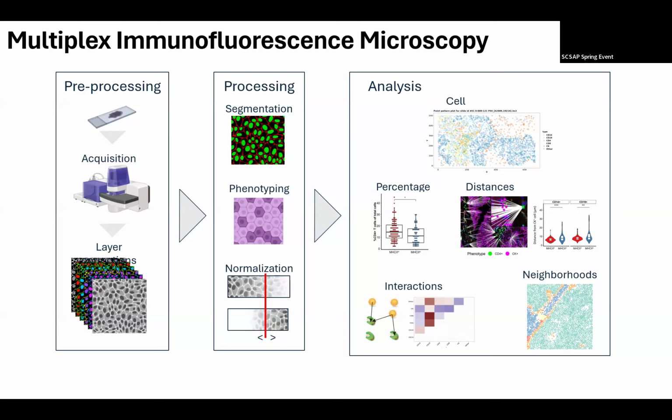As I mentioned, multiplex proteomics, spatial proteomics, has been a recent endeavor over, I want to say, the last 12-18 months. That includes multiple things in terms of pre-processing and all the way up to analysis, and the different flavors of analysis. Some are first order exploratory analysis, which might be just looking at prevalence of cell types.